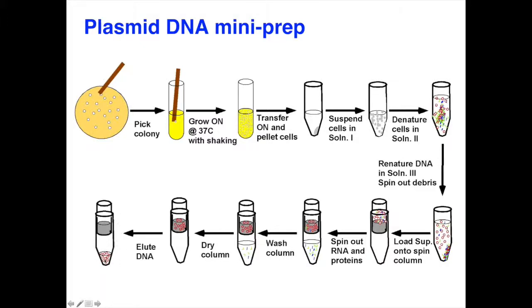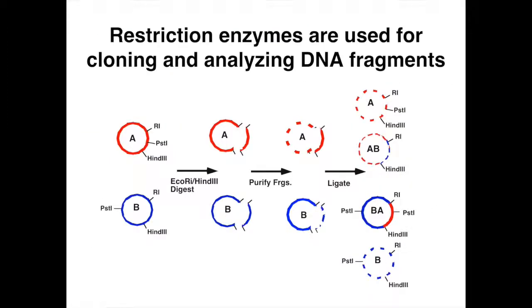We actually spin them into yellow tubes, and you're going to cap the yellow tube, throw out the column, cap the yellow tube, and write MiniPrep on the top so that we know that's the MiniPrep. So that's been done already in lab. And right now, let's take a look at what's actually happening.